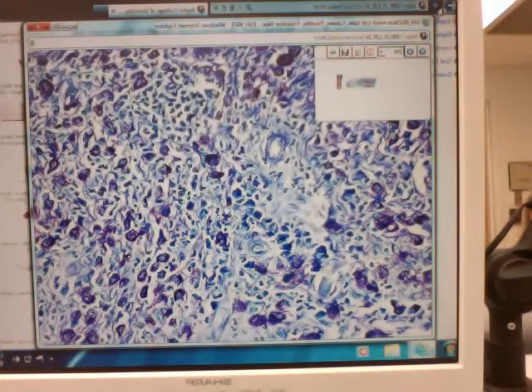You see this blue stained slide with these purple shaped cells, all these purple granuled cells inside of it. These are mast cells. There's no other blue stained slide that you're going to see at this point in class, and no other slide with purple granulated cells in a blue stained slide. So when you see this one, mast cells.